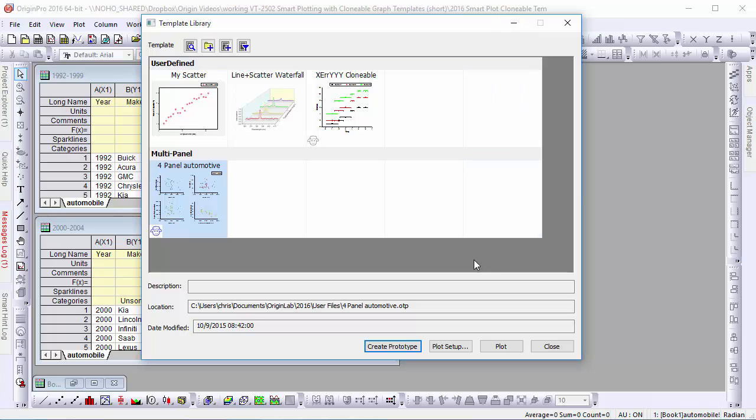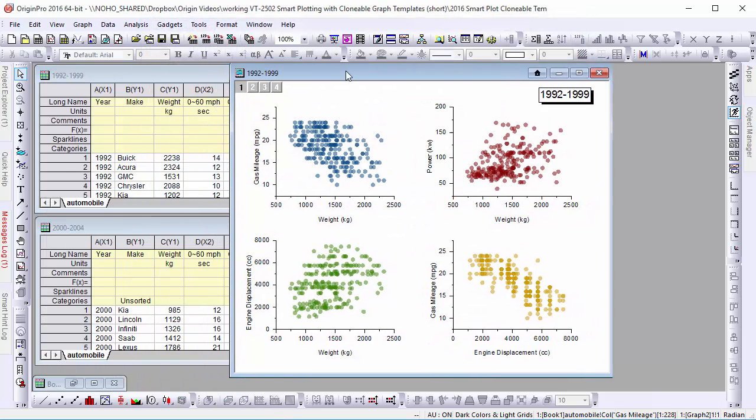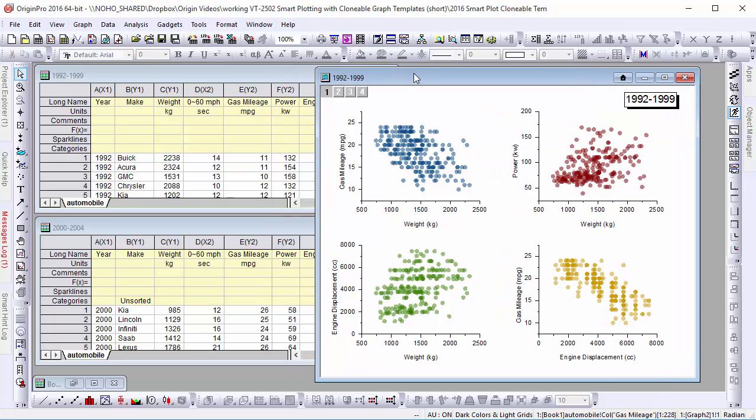Finally, when we create a plot using the template library, it will remain open, allowing us to create as many additional plots as we need.